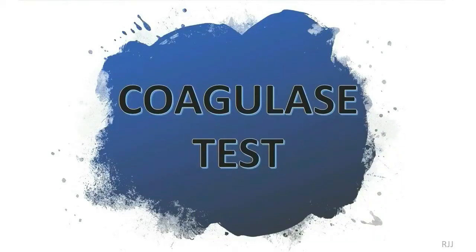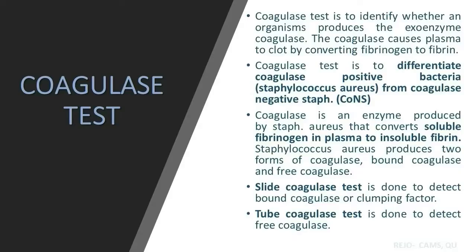Hello, in this video I will demonstrate the coagulase test. So coagulase test is to identify whether an organism produces the exoenzyme coagulase. Coagulase causes plasma to clot by converting fibrinogen to fibrin. Coagulase test is to differentiate coagulase positive Staphylococcus from coagulase negative Staph.